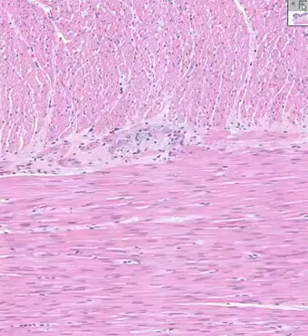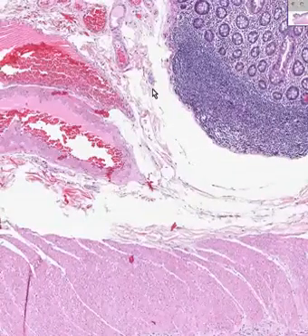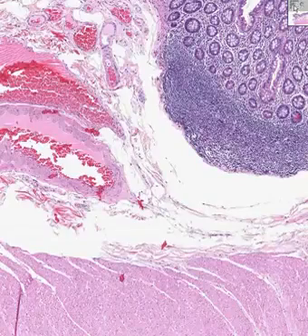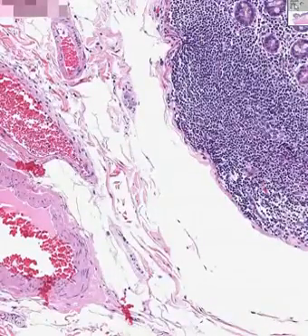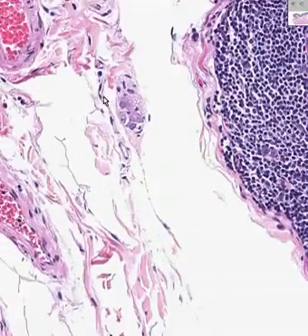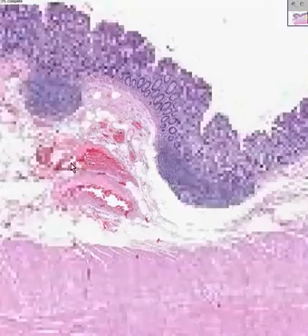Notice that there's another area which you may find ganglion cells, and it will be in the submucosa. And they're a little bit harder to find, but if you are patient, you can probably find some. And do we have one here or not? Looks like, yeah, here we go. We're lucky. We found a submucosal ganglion as well, part of the autonomic nervous system of the colon. There's a submucosal ganglion. And we found just about everything we wanted to find.